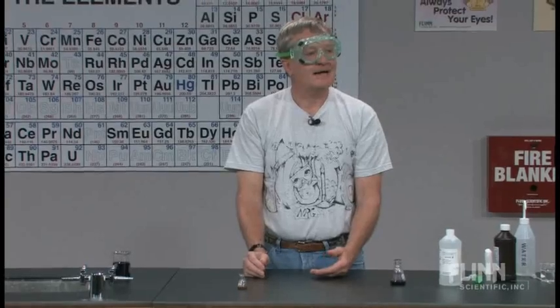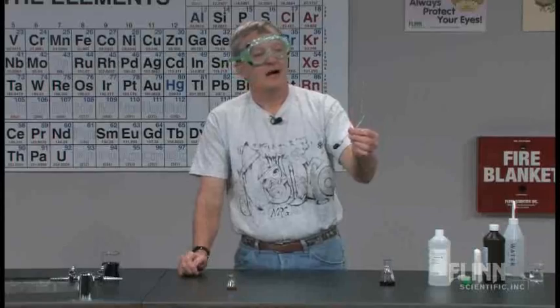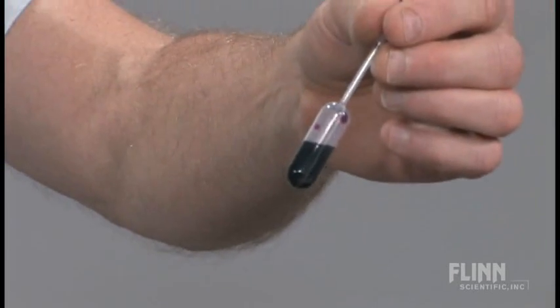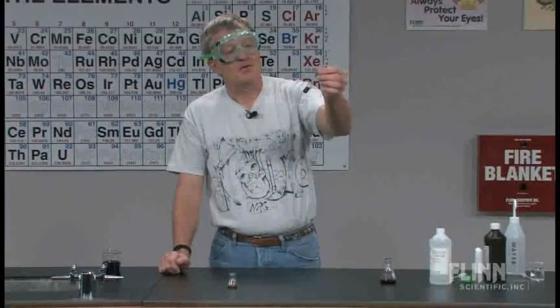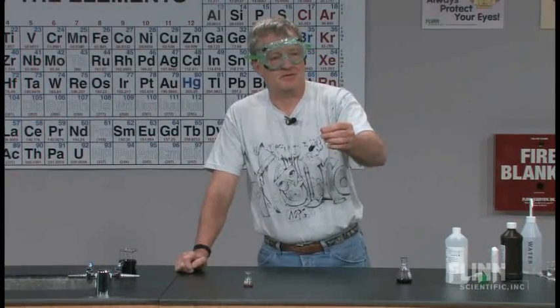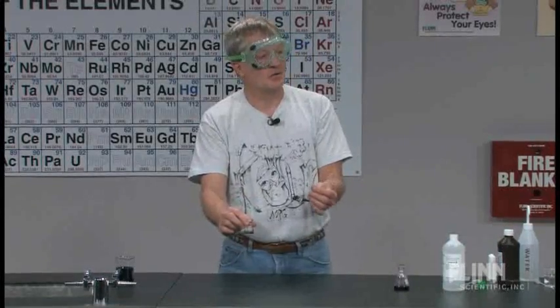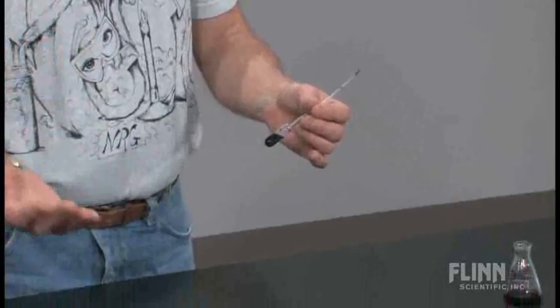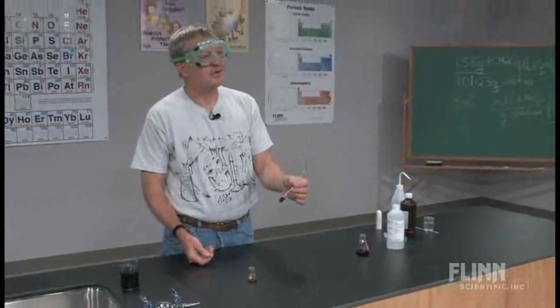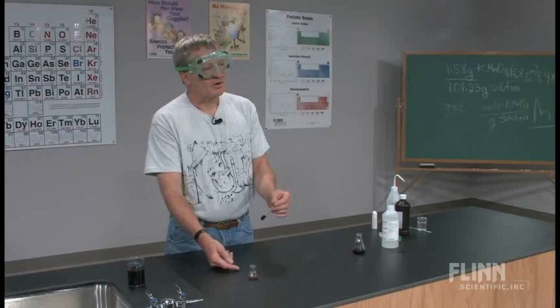What have I used here? A tiny quantity, the total amount of solution maybe a milliliter out of this container right now, maybe a milliliter. How much do I make up for the 130 chemistry students that I teach? Oh about a hundred milliliters of solution. That solution I made a minute ago would last me all day long without any problem. When I'm done with these I can either clean them out, a lot of work, or I can throw them away. They're maybe five cents a piece, something in that general area. Students can do three titrations in no time at all with this. That's the thing that sold me on going to small scale. It wasn't that it was safer, that I use smaller amounts of material, etc. It was that almost every experiment that I did in small scale went two, three, four times faster than the large scale experiments.